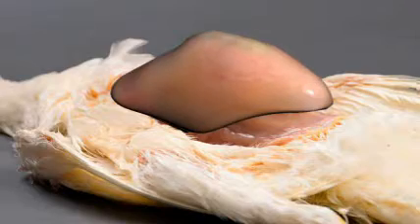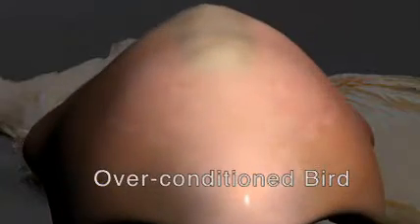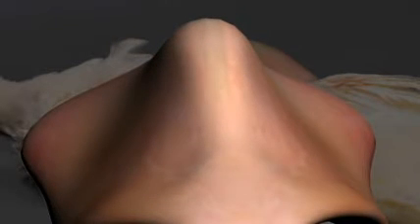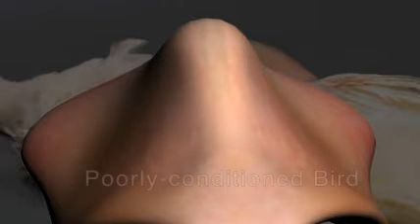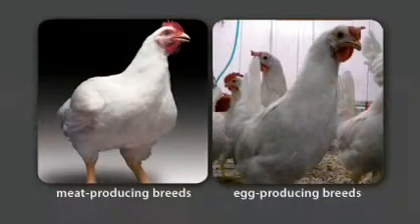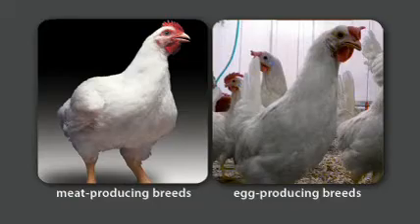In an overconditioned bird, the pectoral muscles will be covered by a thick layer of fat, making the keel difficult to feel. In a well-conditioned bird, the pectoral muscles will be flush with the ventral aspect of the keel. As the bird loses body condition, the muscles atrophy, and the line from the pectoral muscles to the keel becomes more concave. In a poorly conditioned bird, the pectoral muscles will be thin and the keel bone very prominent. The volume of muscle and fat will vary somewhat by breed, with meat-producing breeds having more muscle than egg-producing breeds.